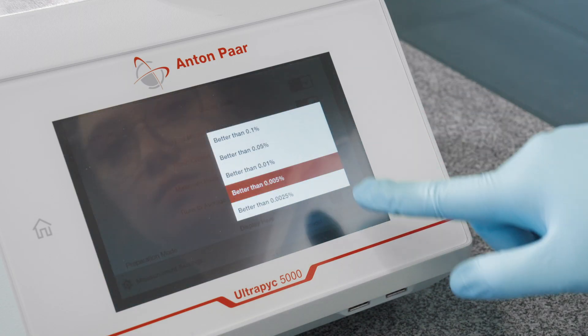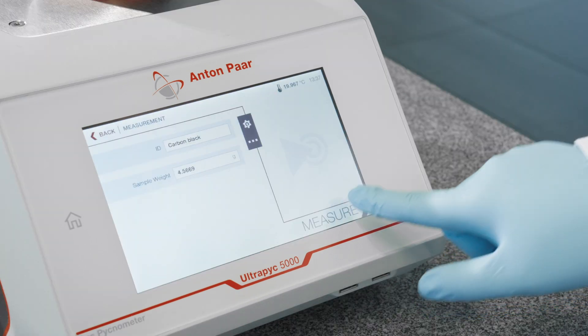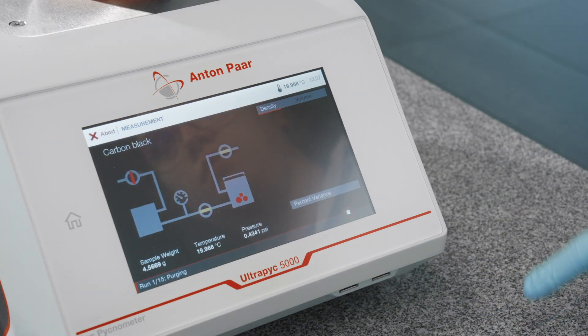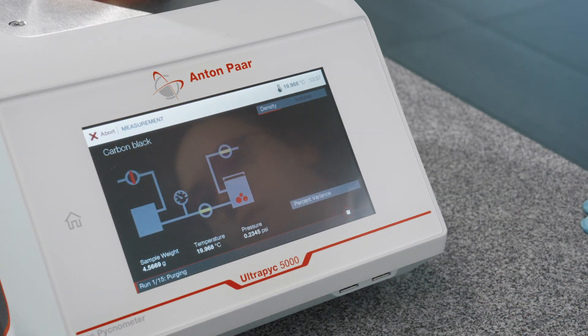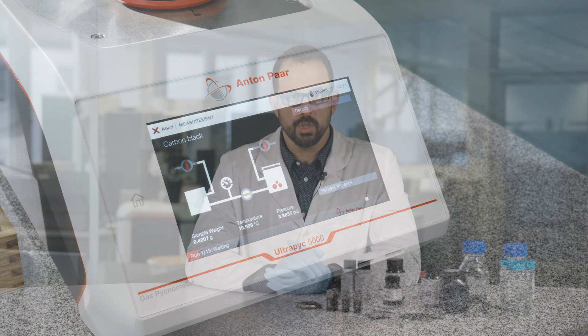And finally, select the end criteria based on the accuracy required. After you start the measurement, the instrument will generate the data automatically and provide the value of the skeletal density of the sample. It is necessary to accurately measure the density parameters of electrode materials to ensure proper characterization of the powder and slurry and predict the effect on the quality of the final product — the battery cell.